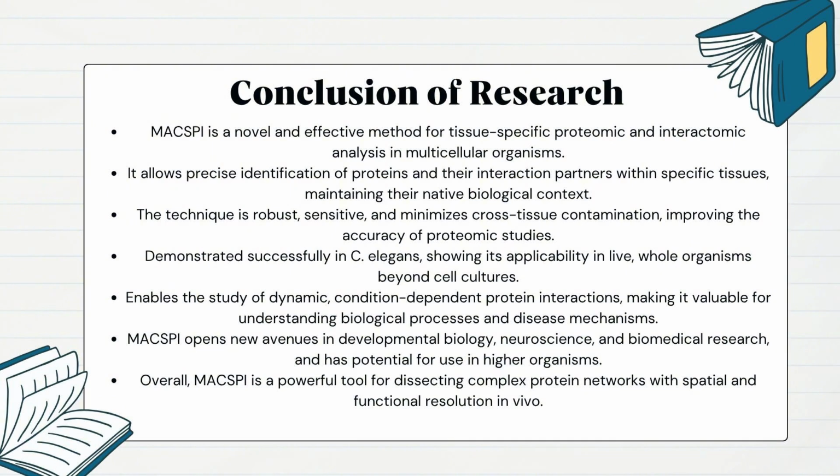And MACSPI enables the study of dynamic, condition-dependent protein interactions, making it valuable for understanding biological processes and disease mechanisms. MACSPI opens new avenues in developmental biology, neuroscience, and biomedical research, and has a promising future for use in higher organisms. Overall, MACSPI is a powerful tool for dissecting complex protein networks with spatial and functional resolution in vivo.